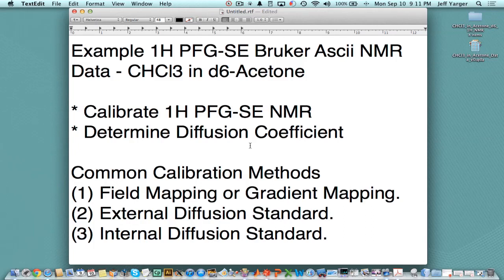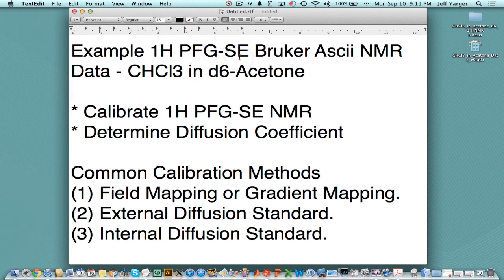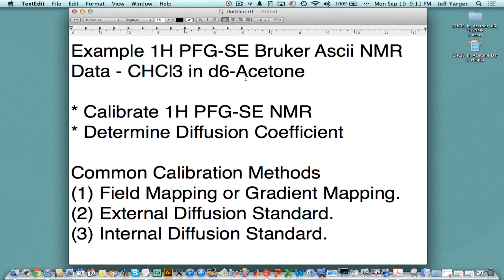Hello, and welcome to another edition of PCHEM Lab Screencast. I'm Jeff Yager, and today we're going to quickly cover an example of pulse field gradient Spinecho NMR using Bruker ASCII data. The specific sample is chloroform and deuterated acetone.